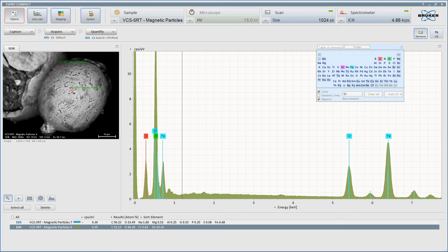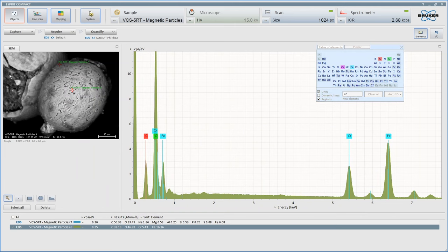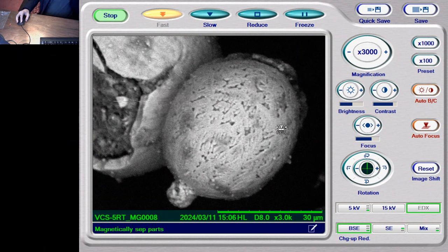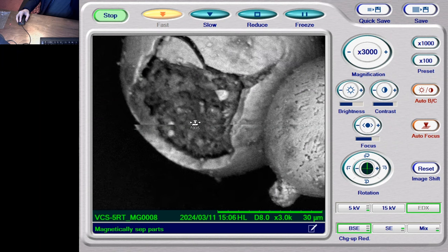So it's done its job over here. Yeah, so there's the answer. It's assessed there to be iron, chromium, and oxygen, and carbon, and hardly anything else. And I suspect this will be essentially just iron and oxygen when we look at that. So we'll go and do that now, shall we? And just move that over there. I suspect all of this in here is going to be mostly carbon.